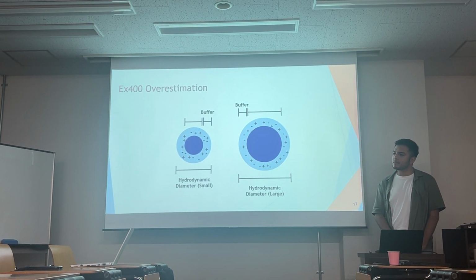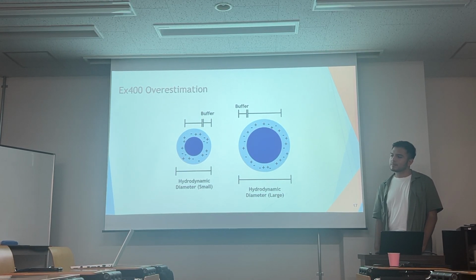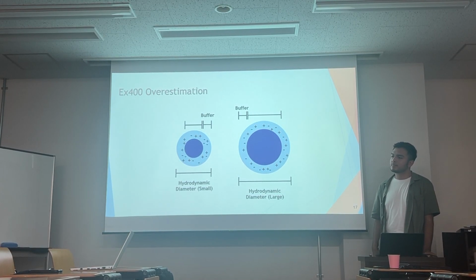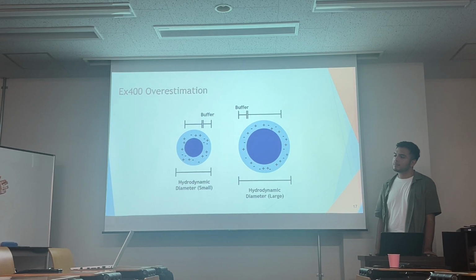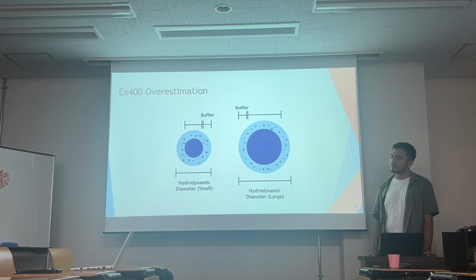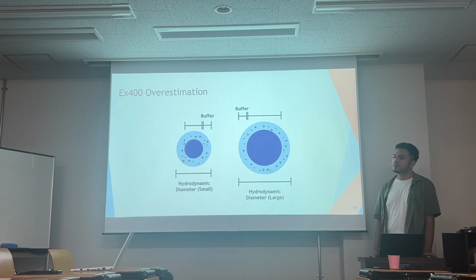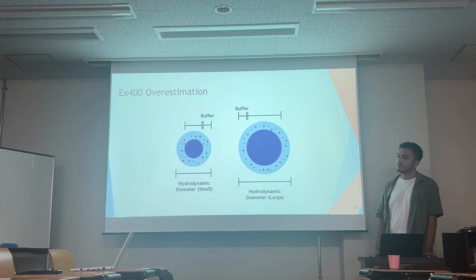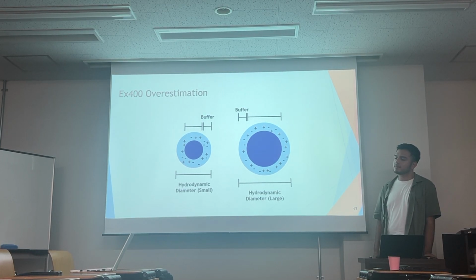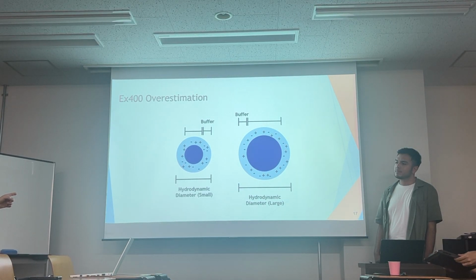But this hydrodynamic diameter is usually the difference in the place where, do you know the zeta potential? This hydrodynamic diameter is sometimes called slip plane.